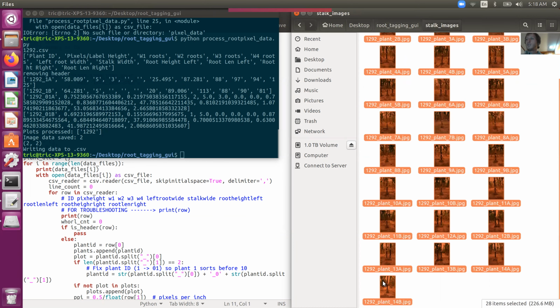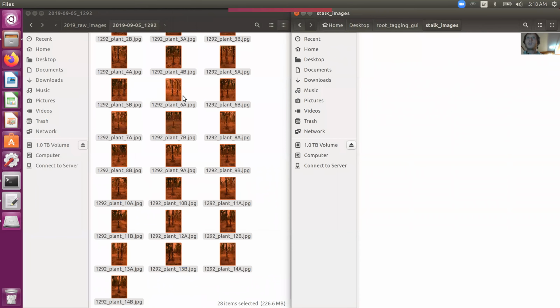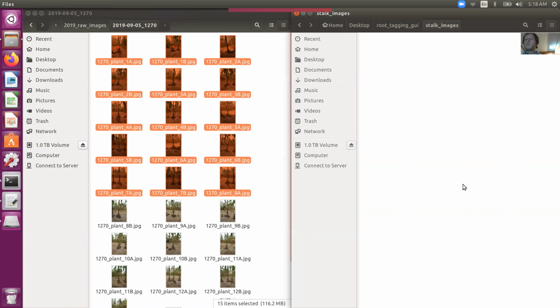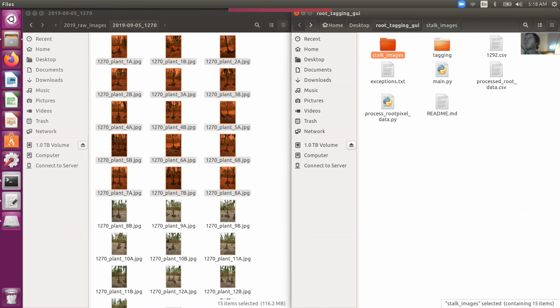You're just going to delete these and go back into your folder with all your images, maybe pick a different image set and copy those, and paste them in here. And yeah, same process. So hopefully everything works out for this. There's not much more than that to do. So good luck with it. Thanks.